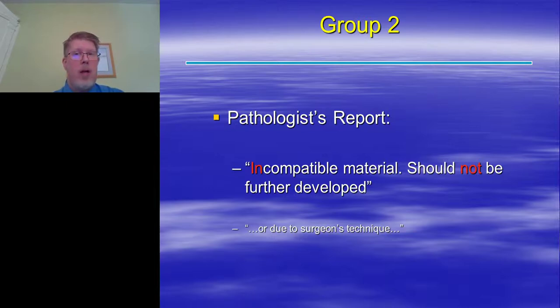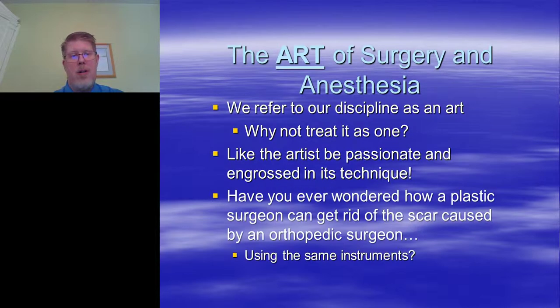But I can tell you, I'm aware of several biomaterials dating back to the 50s that we ran one study on, because again, you usually only get one chance at this. It's done poorly, the pathology looked terrible, and it took decades for that material to be resurrected. Again, you've gone through so much work to develop your molecule, you've gone through so much work to develop your implant. Don't let it fail because of poor technique on the surgeon's part.